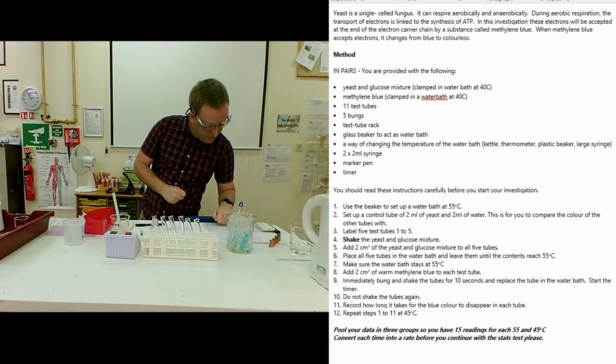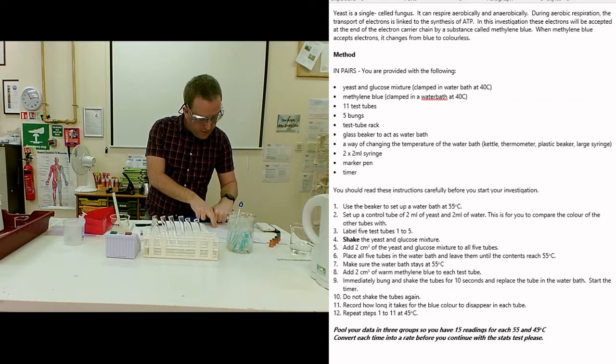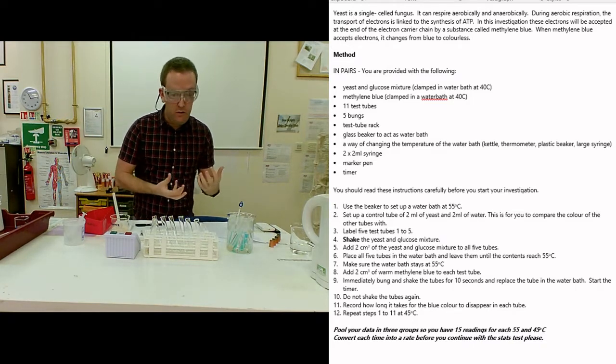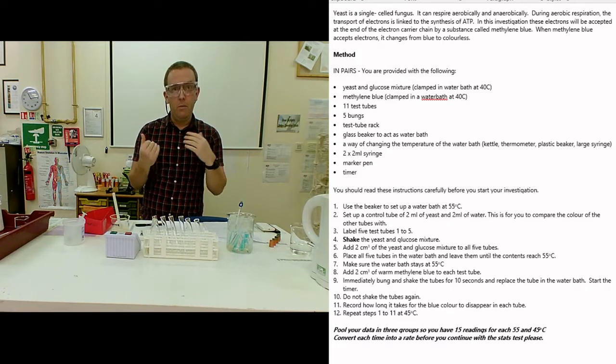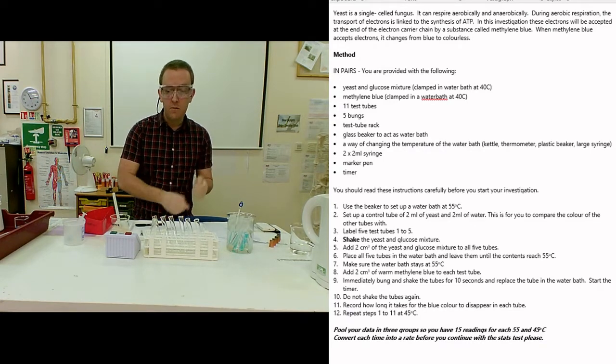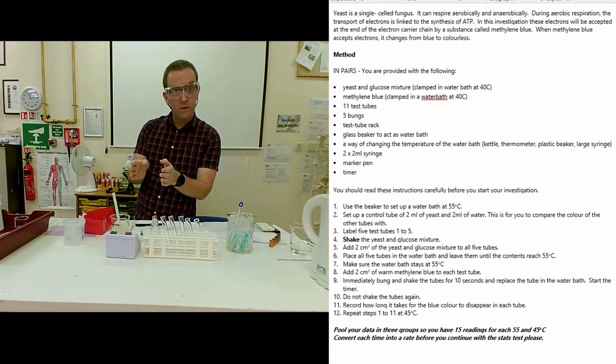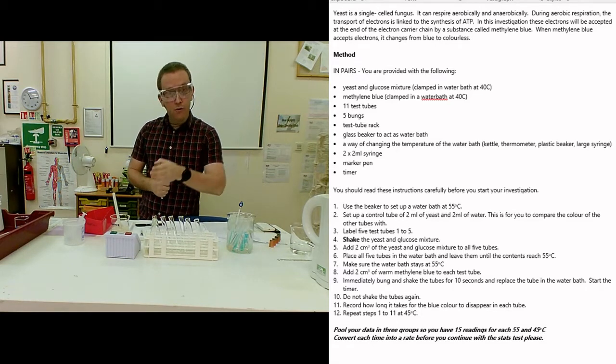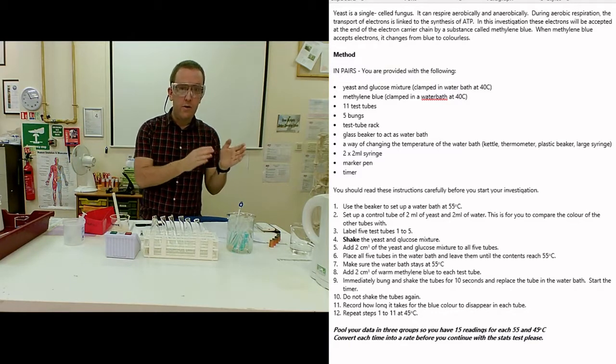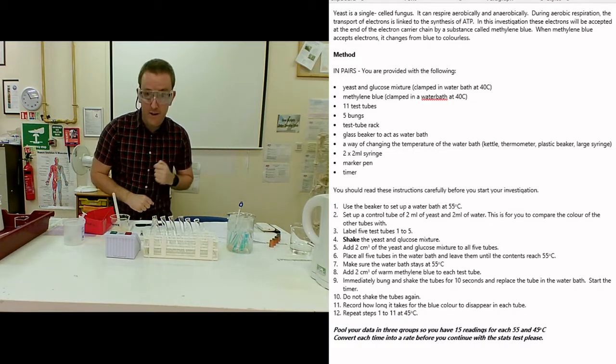It says here: add 2 cubic centimeters of warm methylene blue to each test tube immediately, bung and shake the tubes for 10 seconds, replace the tubes in the water bath, and start the timer. Now I don't have five hands or ten hands, so I can't do this all at the same time. I'm going to do a really important scientific process here for this lab work called staggered addition. I'm going to add maybe two, shake them, start the stopwatch, put those down, and prepare myself for the next ones. Then at maybe 20 seconds I'll add those in. Then I'll know for tubes two and three I just deduct 20 seconds off the time at the end. That way all of them get a nice accurate measurement of their time without the delay of me having to put in the 2 cubic centimeters of methylene blue and give them the 10 seconds of shaking.